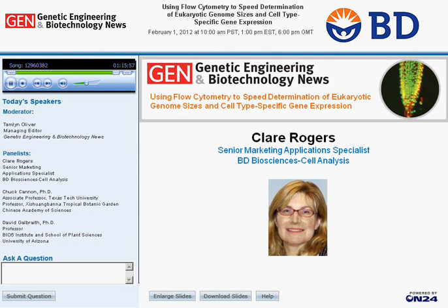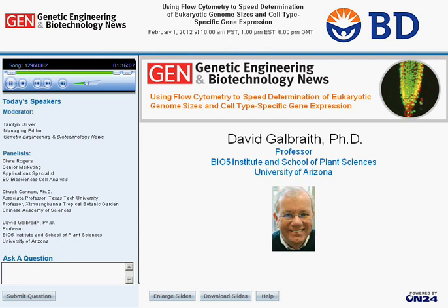Okay. David, actually, I have another question for you. Can one save protoplast fusion products aseptically for further culture after testing DNA content on the flow cytometer? Oh, yeah, this is a question from a former colleague of mine, Dharam Sharma. I reiterate that the Accuri is not a cell sorter, so you can't sort with it, so you wouldn't be able to sort protoplast fusion products.